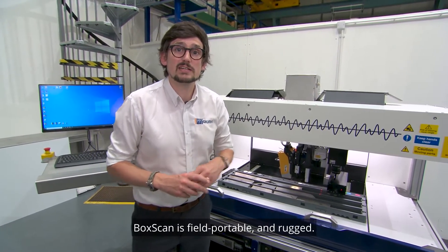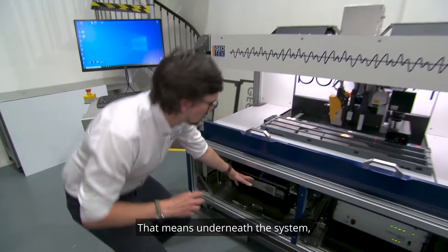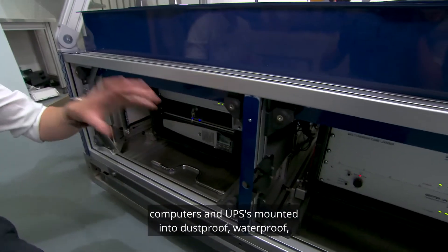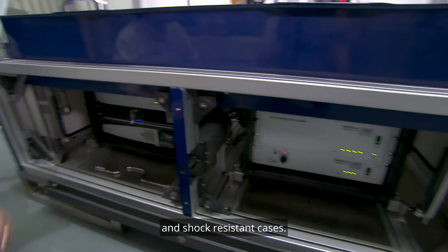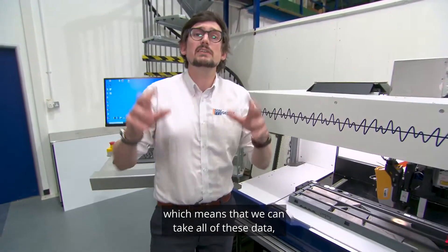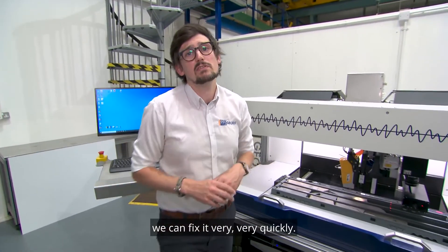BoxScan is field portable and rugged. That means underneath the system we have all of our electronics, components, computers, and UPSs mounted into dustproof, waterproof, and shock resistant cases. They're plug-and-play electronics, which means that if something goes wrong in the field we can fix it very quickly.